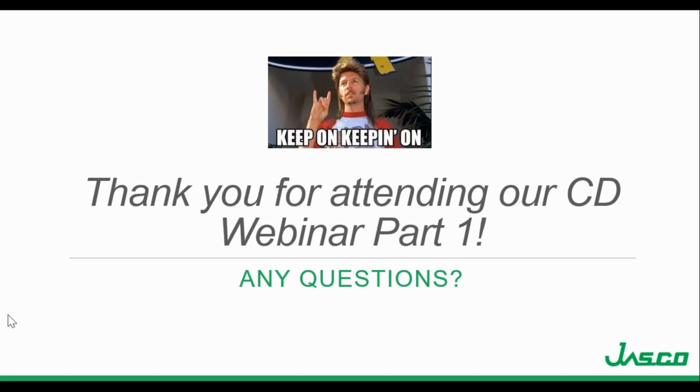Oh, I'm sorry. There was also a question about G-quadruplex estimation programs. We don't have a G-quadruplex estimation program. I don't believe there is a software program to quantitatively estimate G-quadruplex structure out there currently. I do believe there are some research groups that are working on it, but to my knowledge, it hasn't gotten to the point where you can quantify secondary structure.